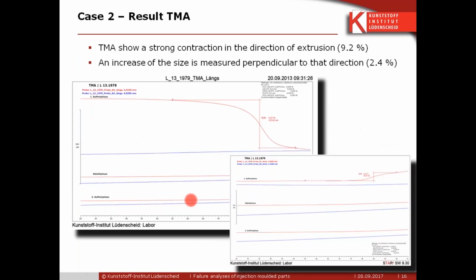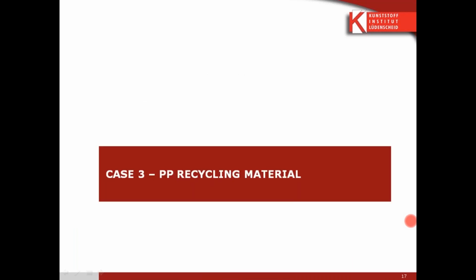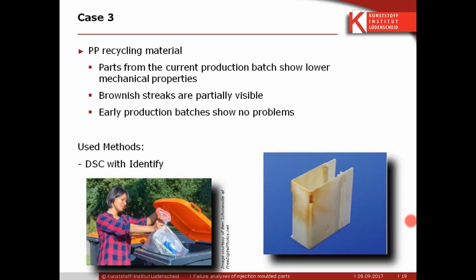What you would do is put a clamp on the top and on the bottom of the fiber, and you hang it into a holder, and then you put a small force on it to keep it stretched, and you watch the elongation as you heat it up. So that's straightforward, and it's just another sample holder of the TMA. I think you frequently use this sample holder as well, Martin. Yeah. Okay. One more.